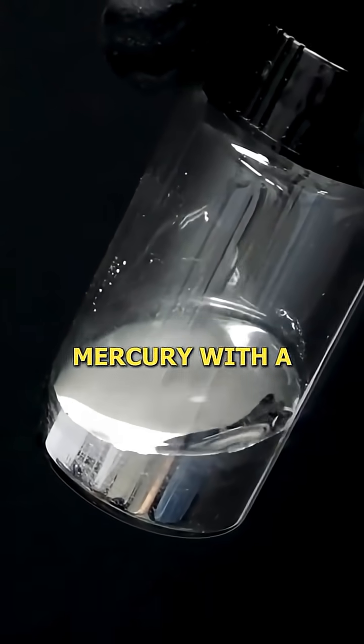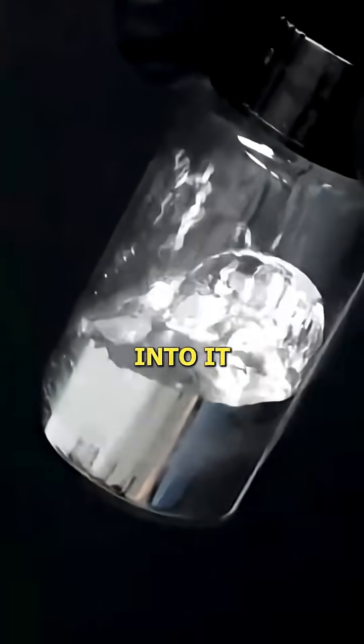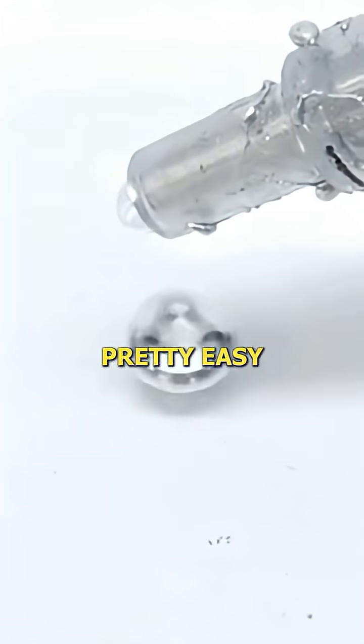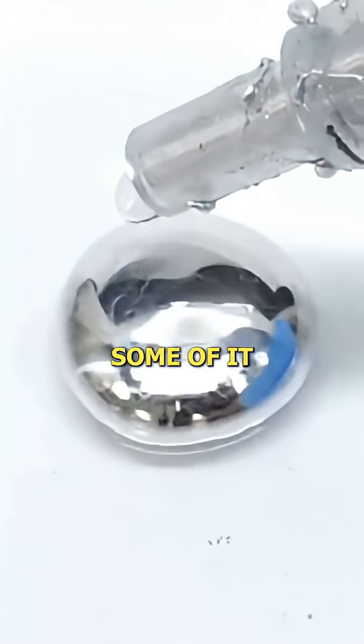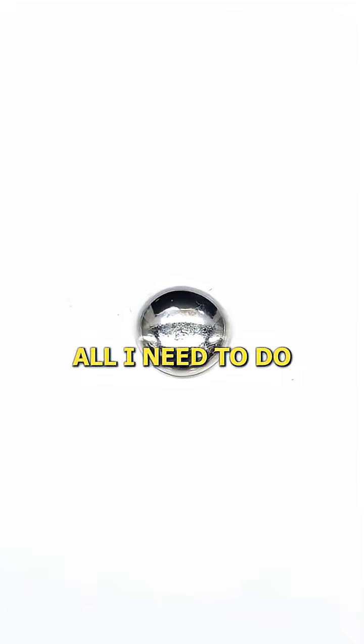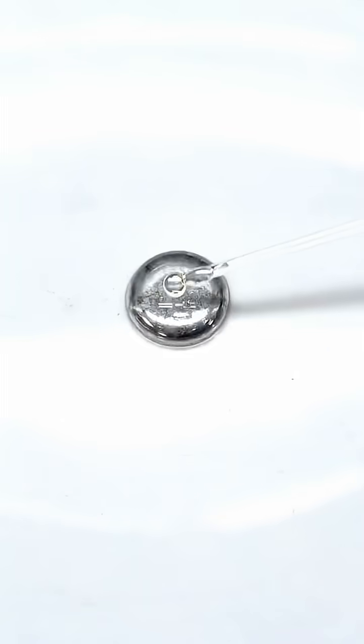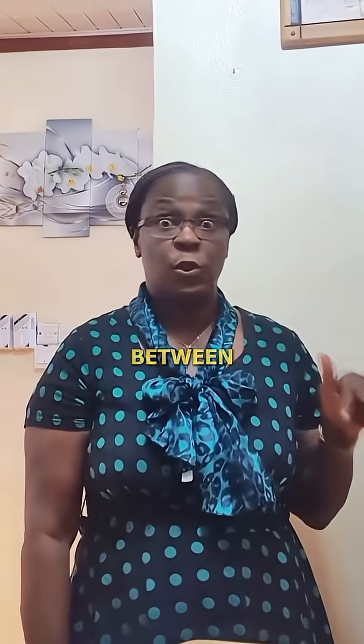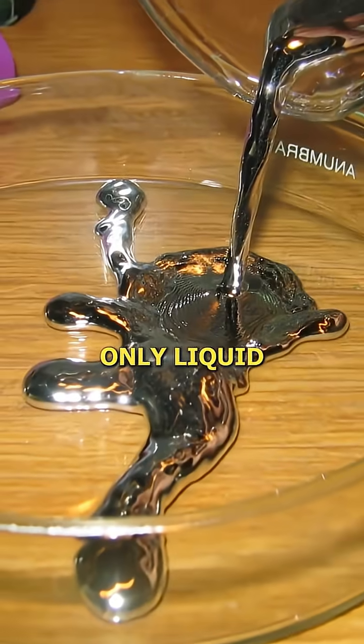What I have here is some mercury with a small amount of sodium metal dissolved into it, and I'm going to do something really weird with it. To do this, I just have to transfer some of it to a dish, then get a solution of ammonium chloride and add a couple of drops.